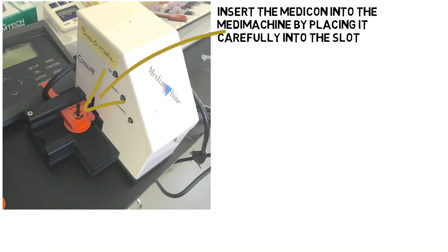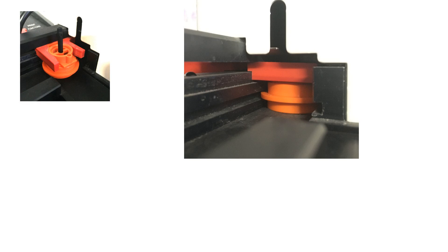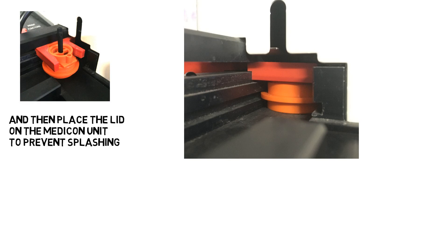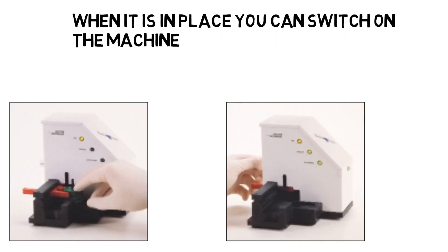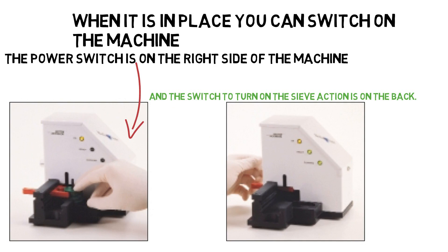Now place the Medicon into the Medi-Machine by carefully placing it into the slot with the small hole facing the front. Place a lid onto the Medicon so the top is covered. Now you can switch on the main power switch on the right side of the machine. To activate the grinding there is a knob on the back which you turn from standby to run. Do this for 30 seconds.